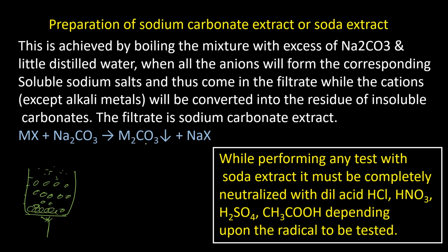The anion combines with sodium and forms the sodium salt of the anion. And we know that sodium, potassium and ammonium salts are soluble in water, so it goes to the solution. That means in the filtrate you have the anions in solution, and that is your sodium carbonate extract.